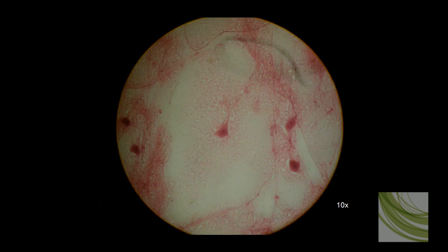Here is that same slide using the 10x objective and again we can see possibly what may be one neuron cell body lying over another because it's hard to tell. Now it looks like an axon is arising but it almost looks like it is from a cell underneath.